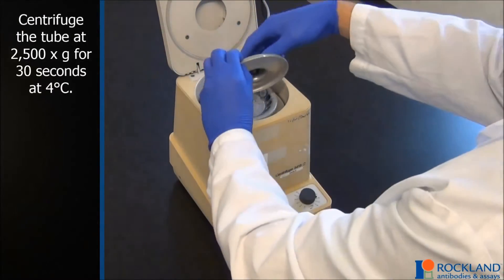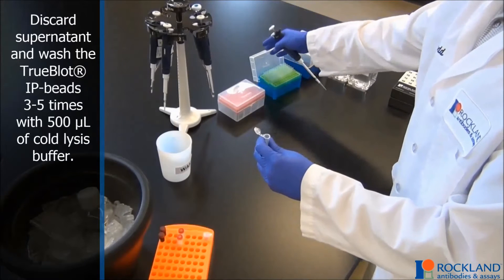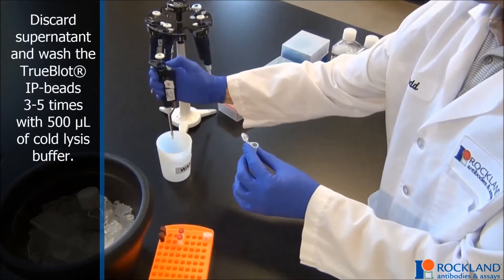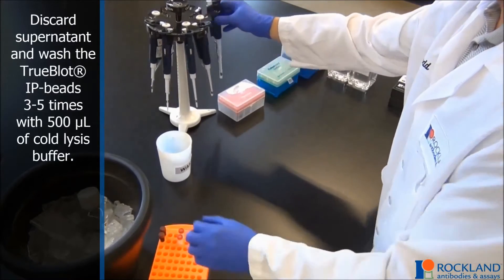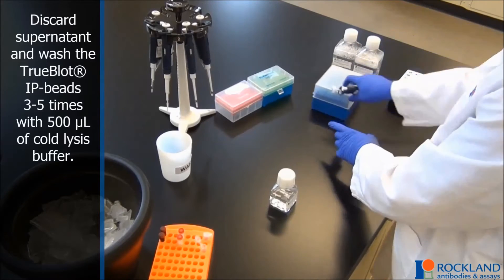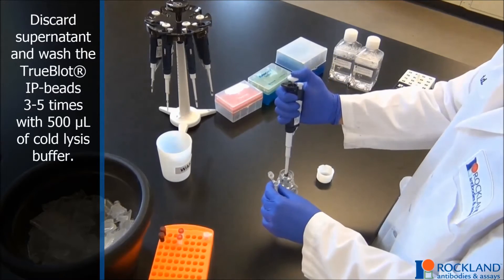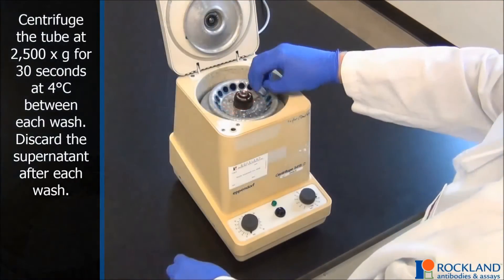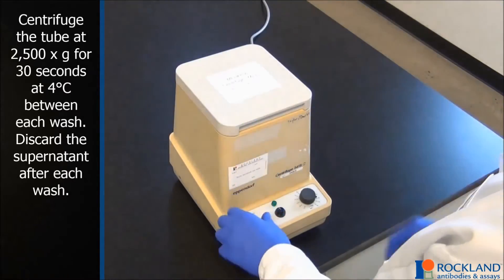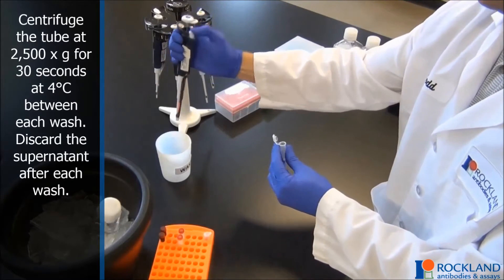Centrifuge the tube at 2500 g for 30 seconds at 4 degrees Celsius. Discard supernatant and wash the TruBlot IP beads three to five times with 500 microliters of cold lysis buffer. Centrifuge the tube at 2500 g for 30 seconds at 4 degrees Celsius between each wash. Discard the supernatant after each wash.